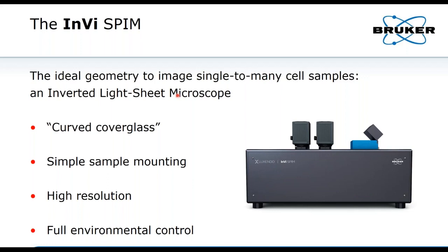There, they had to mount it inside the gel, inside the agarose that I mentioned already. And while they could image for a very long time with a very high time resolution, the gel resulted in the freezing of the biological development of the mouse embryos. They just stopped dividing at some point. That is something you only realize after 24 hours of imaging, most likely due to the physical constraints imposed by the gel into which the sample was mounted.